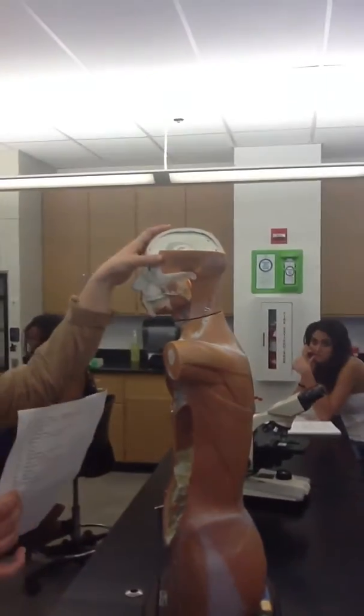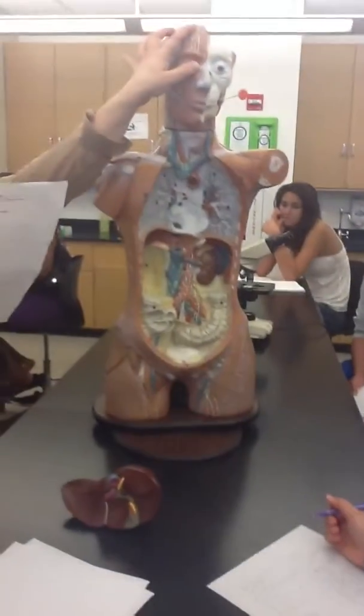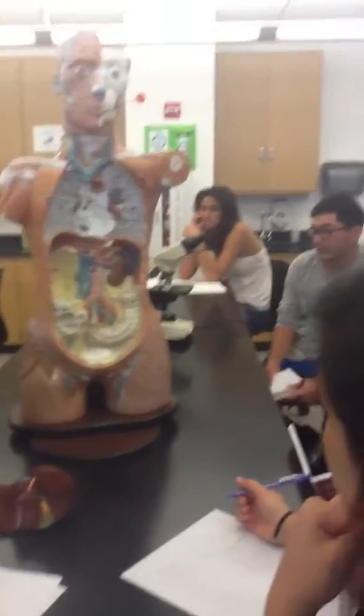We are now in 25, which is the parotid gland. This is one of the salivary glands. Okay, so 26, it's the slide. 26 is the slide, pancreatic islets, okay? And pancreas, definitely.